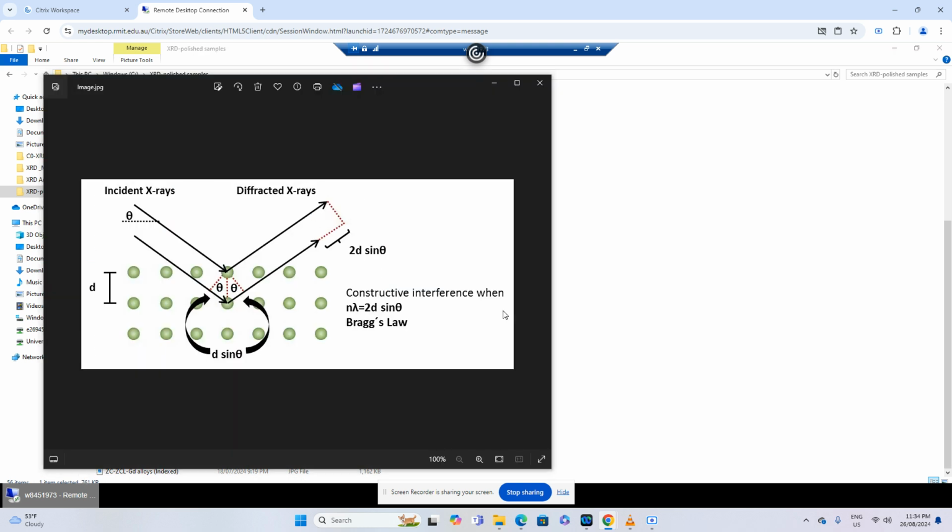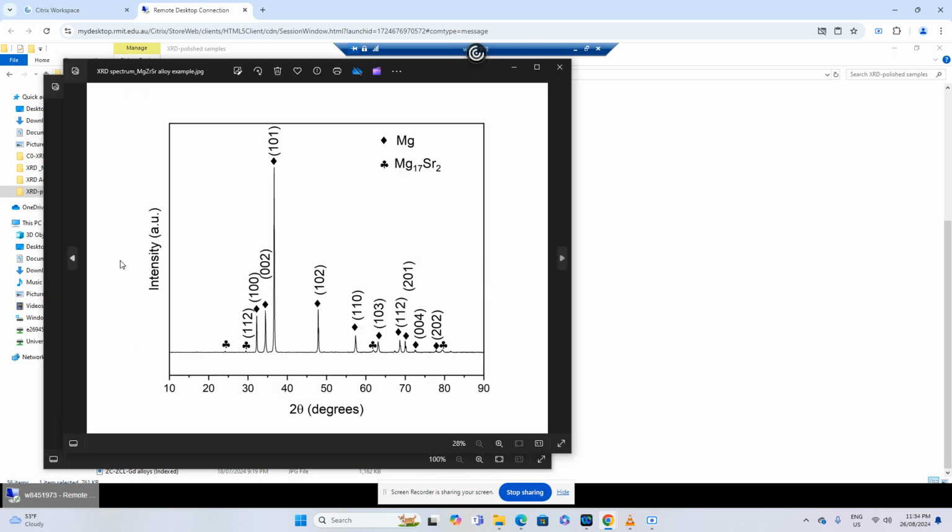Yep, here you go. So you can see that we have created an image. We just have to provide the format of the figure, like JPEG or TIFF format. The resolution is generally 300 dpi by default, and we provide a path and the name of the file, and it will be saved on your computer. You can save it on your desktop or anywhere. You just provide a path, and in this way you can create this JPEG image, and then it can be used in your reports, or in research papers, or wherever you want to use it.